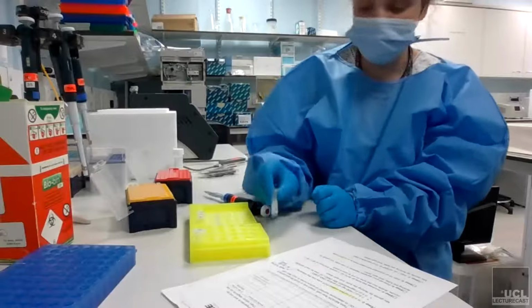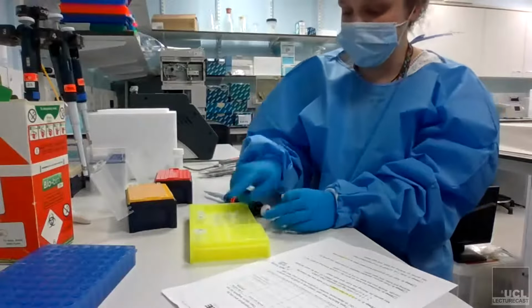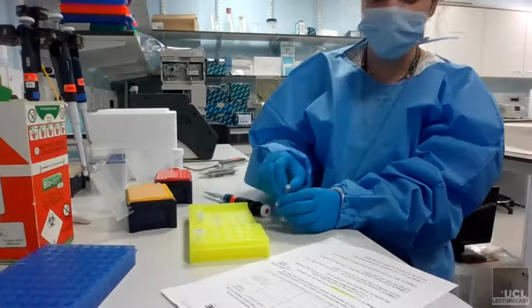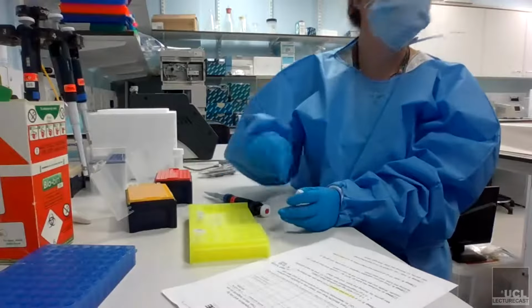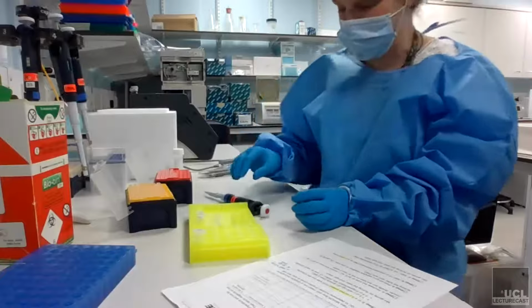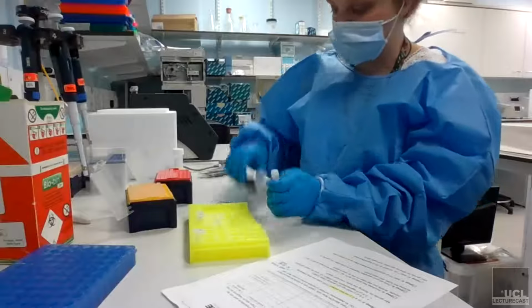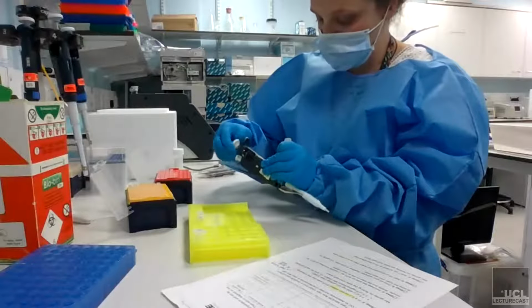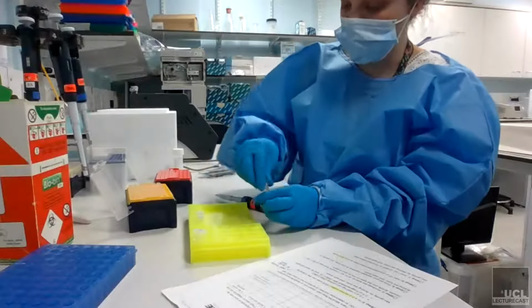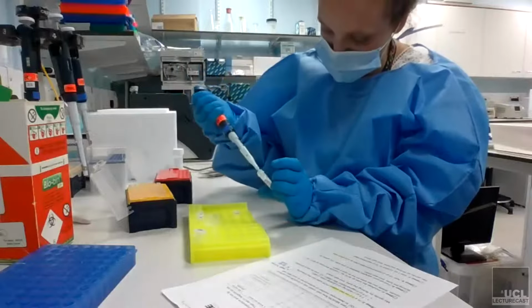Obviously you need to make sure you know which sample you have added each barcode to. I tend to label my samples 1, 2, 3, 4, 5 as I go along so that I know that I'm adding barcode 1 to sample 1, because if you forget, then you're not going to know what you put in what. So all I'm going to do now is put 2.5 microliters of my barcodes into each of my samples. So barcode 1 is going into sample 1.